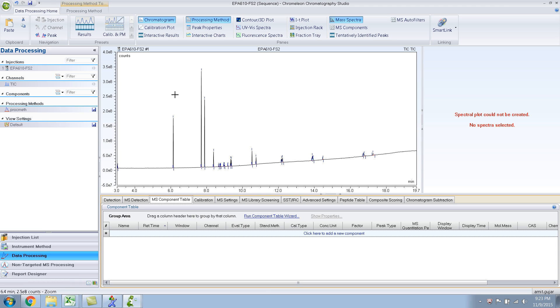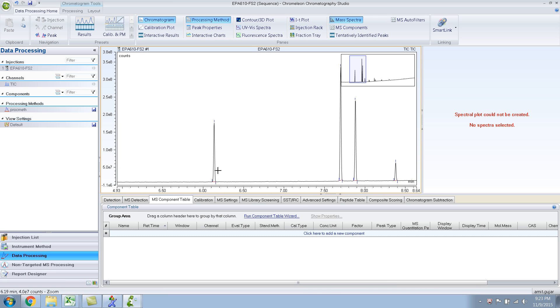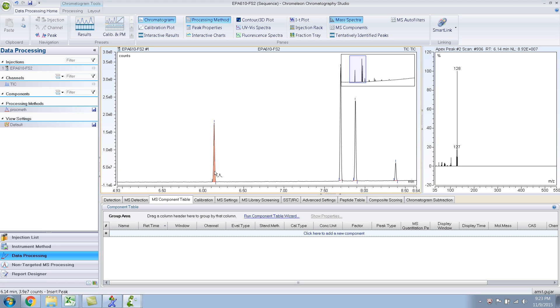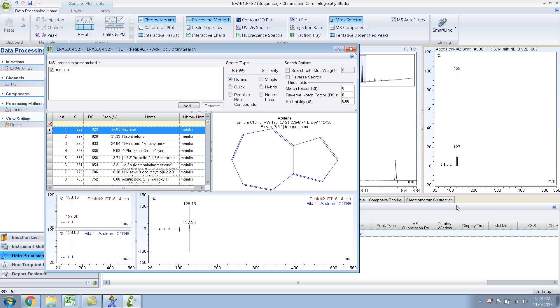So the first thing, if you want to enter compounds into your component table, you need to know what compound it is. So let me zoom in. What I do is, like I've shown previously, you click on the peak and then you do a library search. Right click, find a library.